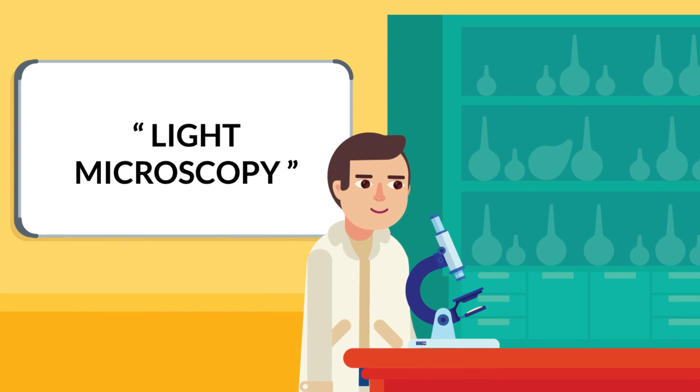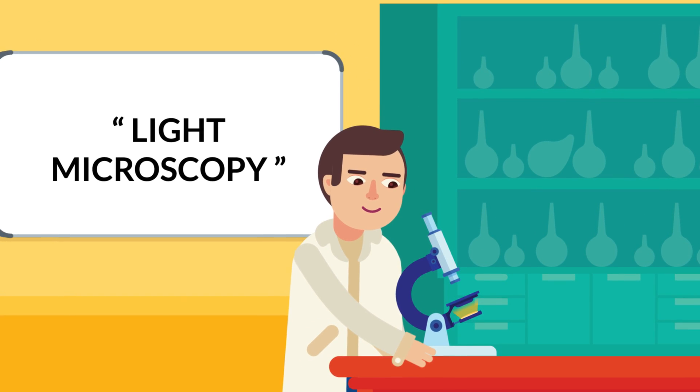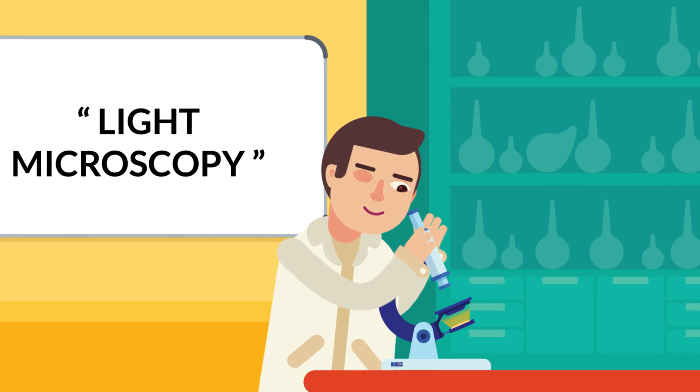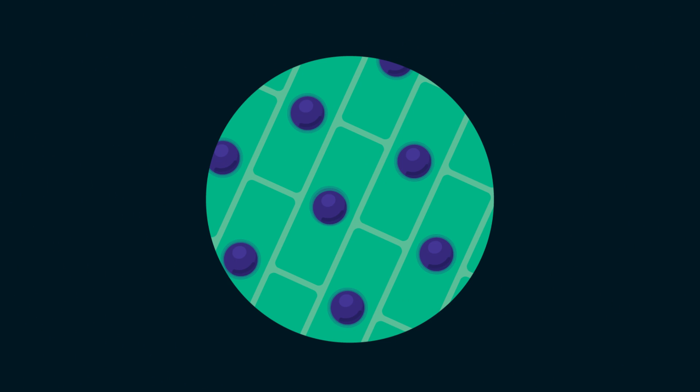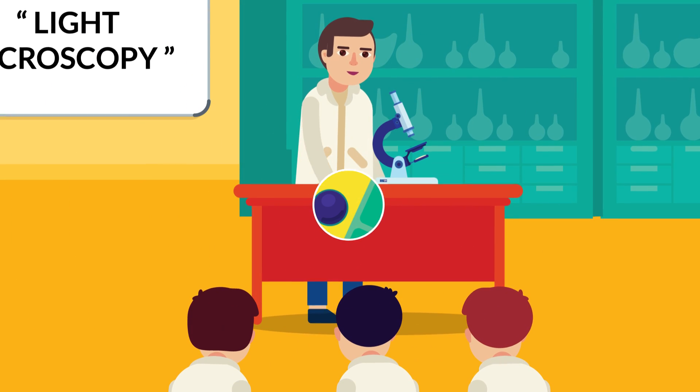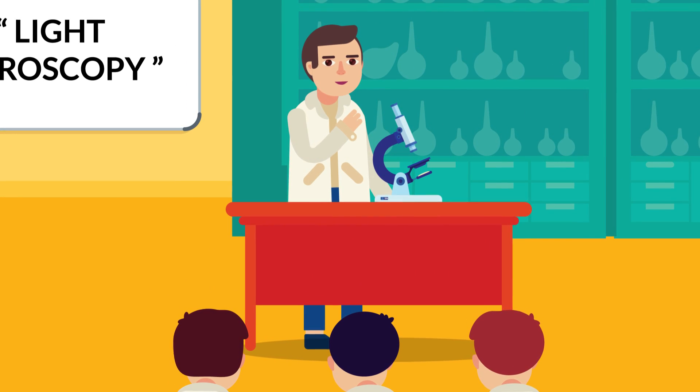Light microscopy: The light microscope uses light as a source of radiation and has shown us inside cells. It shows us simple structures like the nucleus, the cell wall, and the cell membrane. A light microscope is still used in basic studies in schools today.